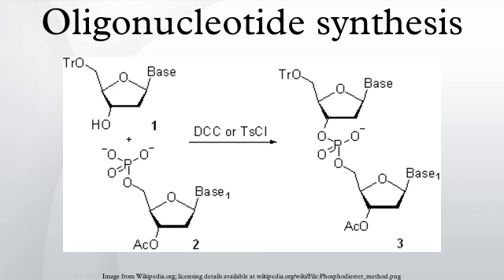Synthetic cycle. Oligonucleotide synthesis is carried out by a stepwise addition of nucleotide residues to the 5'-terminus of the growing chain until the desired sequence is assembled. Each addition is referred to as a synthetic cycle and consists of 4 chemical reactions. Step 1. Deblocking. The DMT group is removed with a solution of an acid, such as 2% trichloroacetic acid or 3% dichloroacetic acid, in an inert solvent. The orange-colored DMT cation formed is washed out. The step results in the solid support-bound oligonucleotide precursor bearing a free 5'-terminal hydroxyl group.